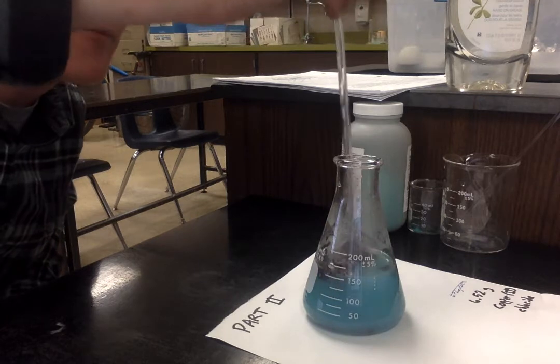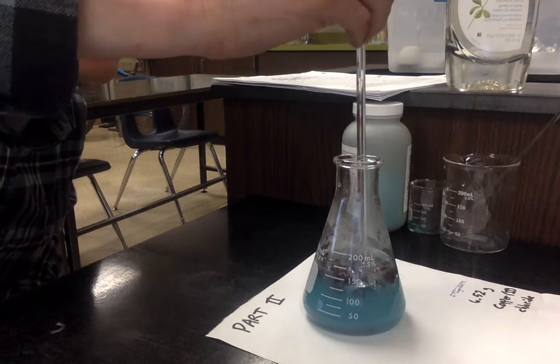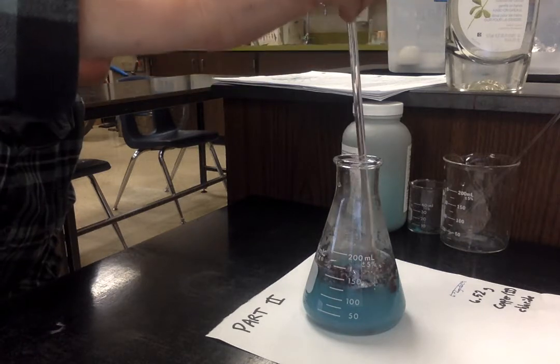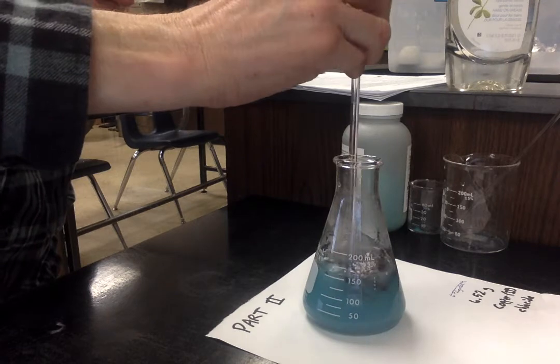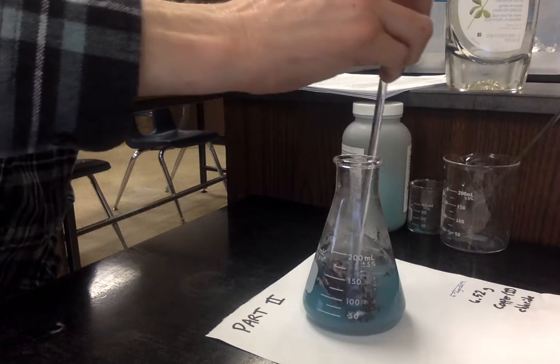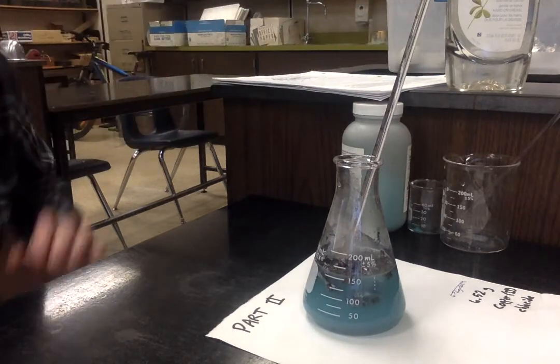So again, at this point you should be able to give me some qualitative observations and some quantitative observations. How much gas was made? How long did it take for it to get made? What kind of temperature increase did we have? Still stirring this. Stable at 30 degrees Celsius.